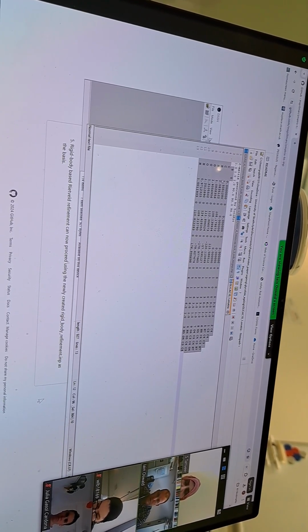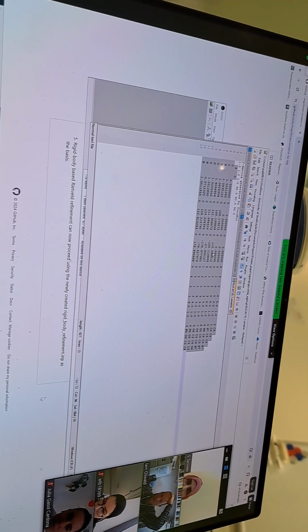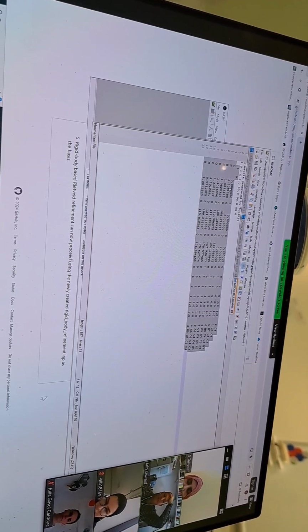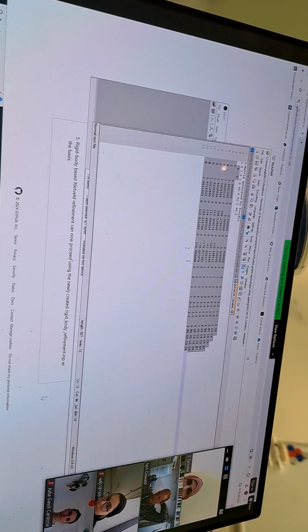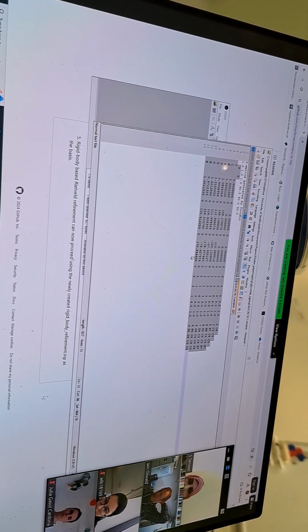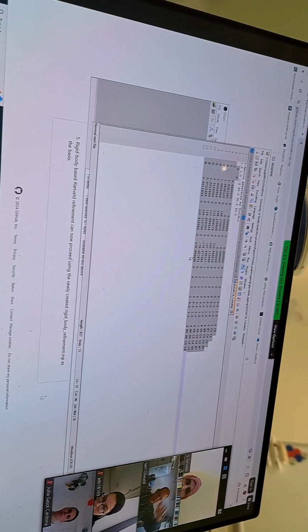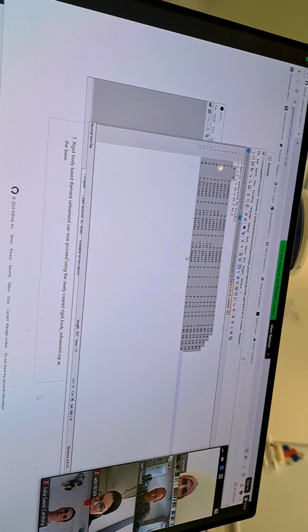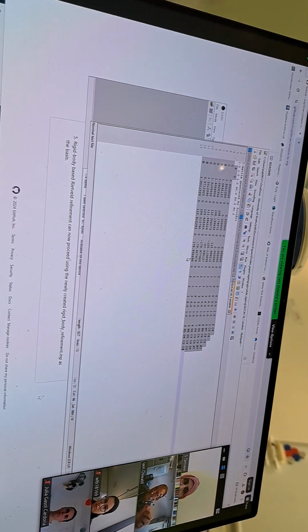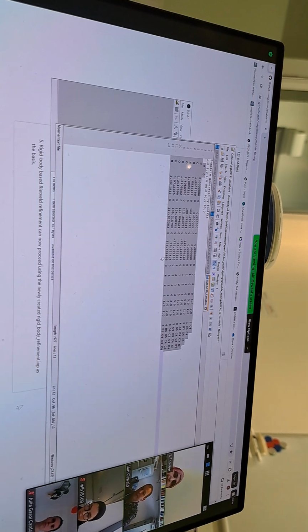It's not the way I like to look at it, and I much prefer the Topaz one, so we'll get onto that in a minute. But you can see there that there are distances between various atoms and so forth, and angles. So you don't need a coordinate system for your Z matrix. You don't need to know what your unit cell parameters are. You can create a Z matrix out of anything. Okay, so if you dream up a molecule, then you can create a Z matrix of it quite easily.